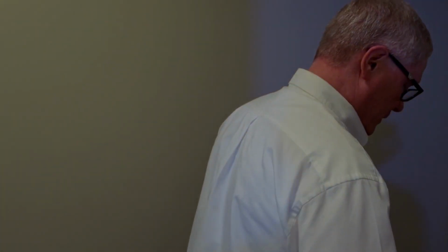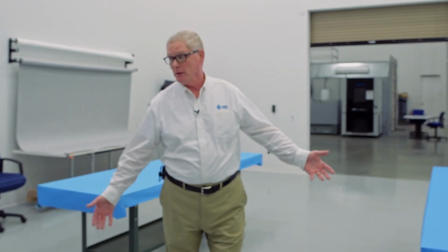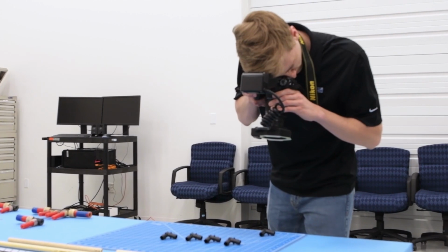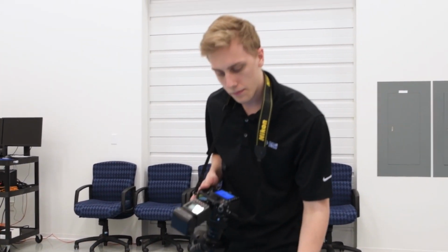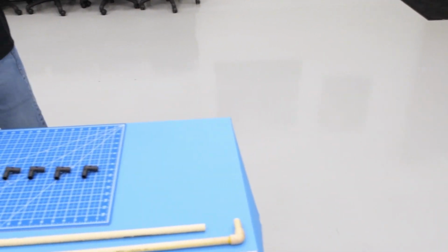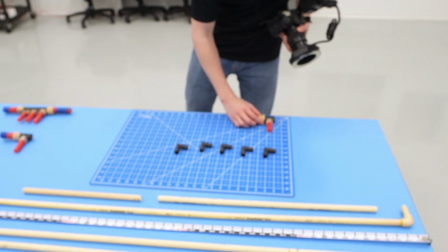And after we're done taking a look at the samples and the specimens in our microscopy lab, we also have additional capability here, and a lot of times the pieces that are brought into those labs come from an inspection that's conducted here in a laboratory such as this one. This is a fairly large space, allows us to get large specimens, large samples in to take a look at, and still have multiple people around, and photographic capabilities, microscopy.